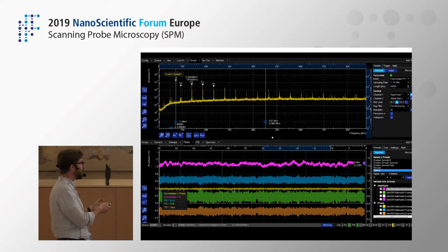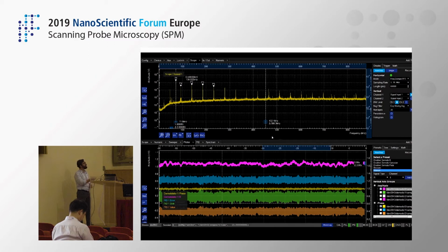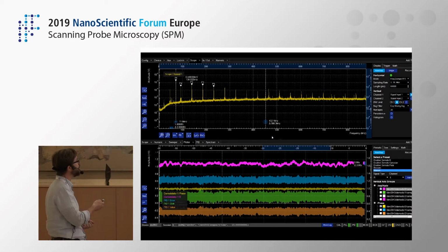That's also a way to illustrate big data or data crunching, because this is an FFT, which can go to quite a high frequency, and then you can end up with a lot of points, something like a gigabyte of data. Either you take the brute force approach and get the whole data set, or, if you consider that maybe only 10 of these peaks are enough, you can just measure the amplitude and phase at this point and this point and this point, etc. That corresponds to the demodulated output that you can get as a function of time. And this, of course, is much more reduced now.